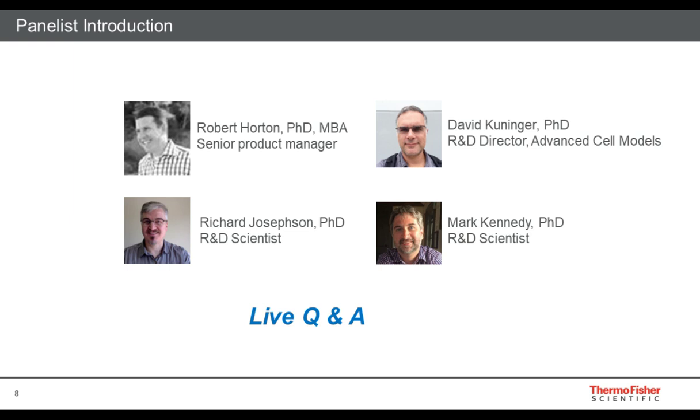Right. And I would imagine success rate would vary based upon the model you're looking at, right? Even starting from the cells that you initially used to form the model. Yeah. Absolutely. There are definitely lots of things that contribute to it. I'm sure there's variability, especially with iPSC lines. Yes. I'm sure there's variability with embryonic stem cell lines as well.